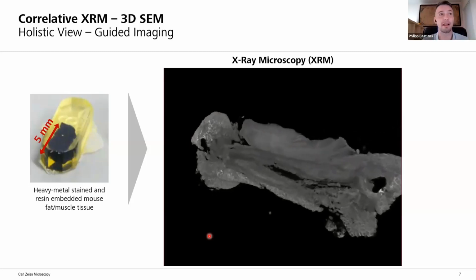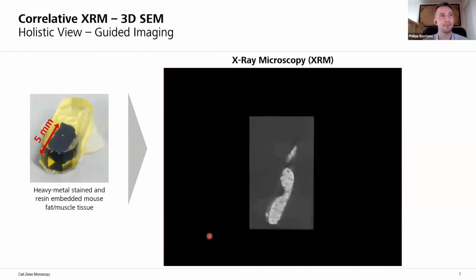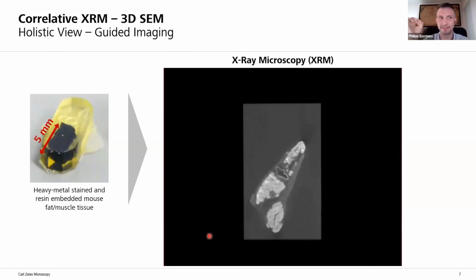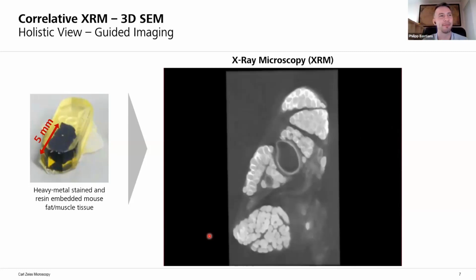And this is the data set that we got out of it. These blobs that you see are actually fat tissue. And then at some point you will see there's a cylindrical shape in the cross section, right? I was really happy because I knew now, in this multi-millimeter dimensioned sample, where to go. So I presented that to the researcher: here's our vessel, and there's potentially the collagen network around it. The researcher got back to me and said, that's true, that's a vessel, but it's a blood vessel. We need a lymphatic vessel. And the actual vessel was down here. That's a lymphatic vessel.